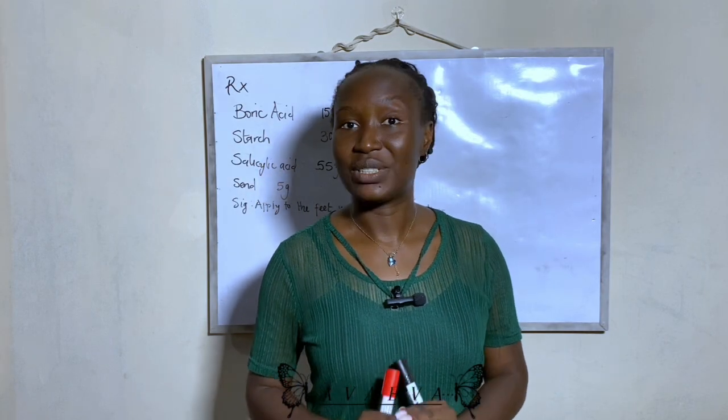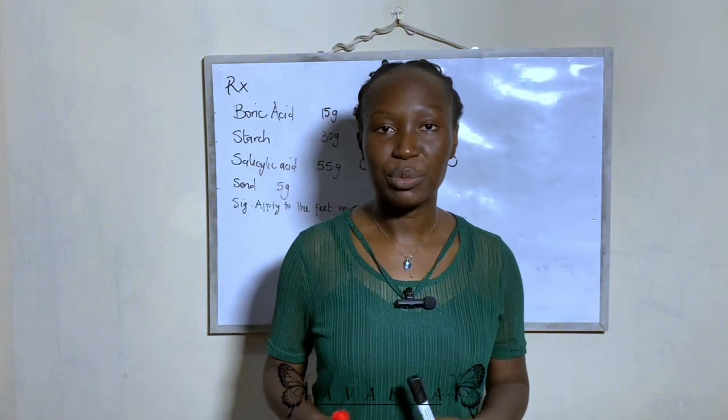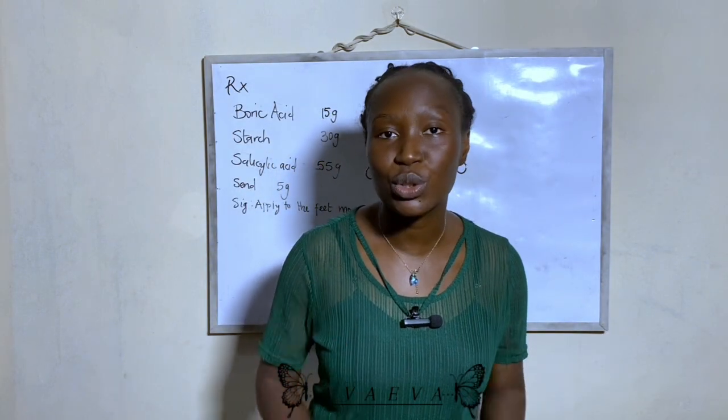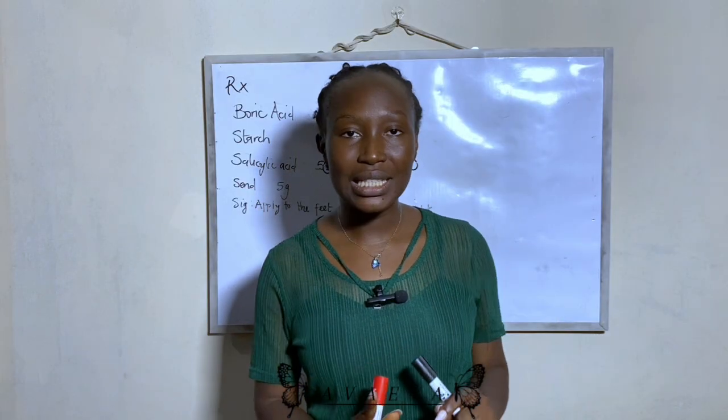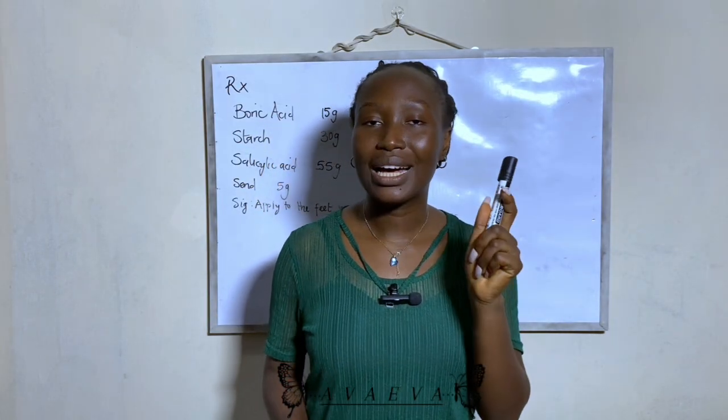This is the basics of dispensing and we're going to be looking at both external and internal preparations. We're going to cover powders, solutions, suspensions, and emulsions. And for dispensing, of course, you're going to need your BPC, your mortar, your pestle, your black and red pen.